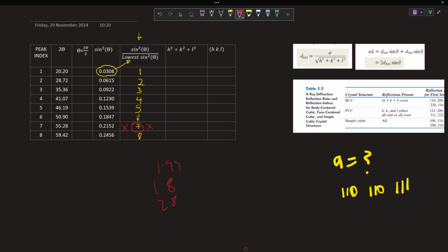So sometimes what I do is I know that if I continuously multiply 2 by all these things, I'm going to be getting a decimal number. I think somewhere here, if I multiply 2, I should have 3.98 or something. So what I do sometimes is, I know my goal is to arrive at 4, a whole number here. So the first thing I do is I say 4 divided by 1.99. When I do that, I get 2.01. So I'm going to multiply all through by this 2.01, so that when I multiply it with this, I'm going to get 4 directly. I don't have to be approximating.